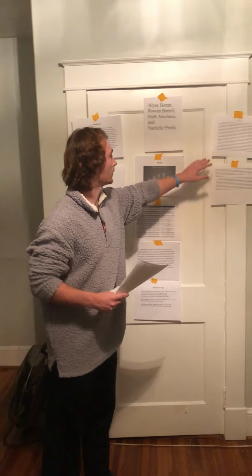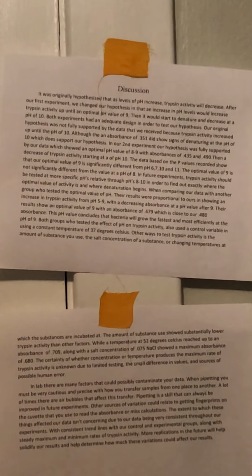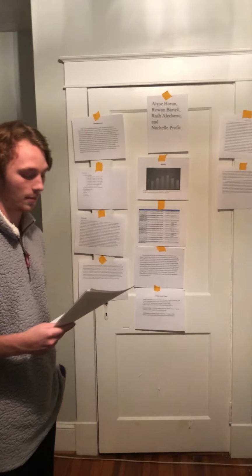So for discussion, it was originally hypothesized that as levels of pH would increase, the trypsin activity would decrease. After our first experiment, we changed our hypothesis to reflect that it would increase and then eventually start to denature and decrease at a pH of 10.